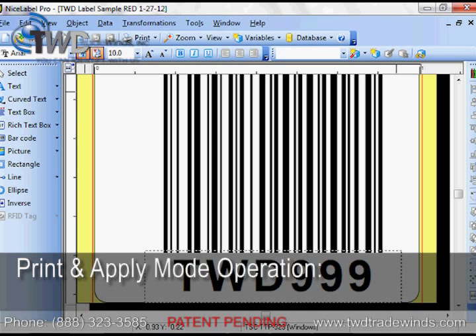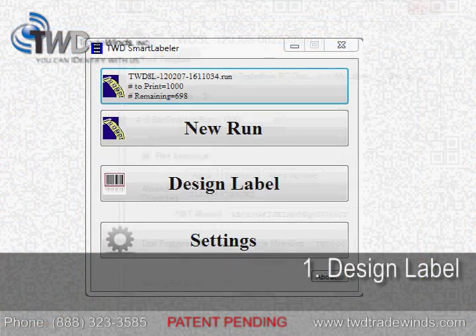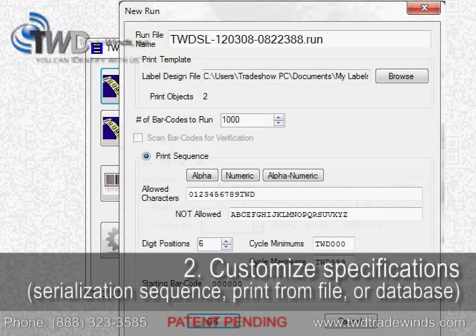For print and apply mode, use TWD's Smart Labeler software on the PC to design the label you want, and then customize how you'd like to print the labels.